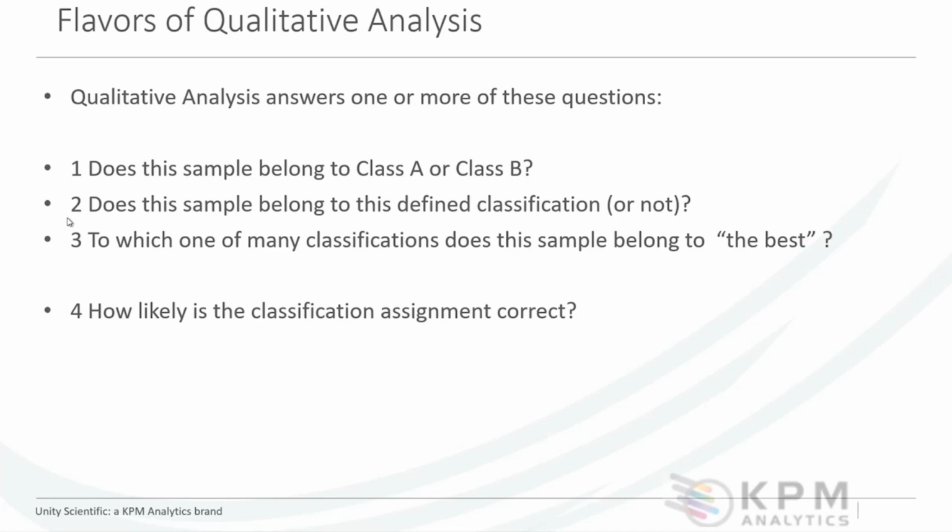So this is, am I good? Or am I, for some reason, not good? Do I not belong? Finally, we can look at which of many classifications or which of many groups does this sample belong to best? Which group am I most similar to?